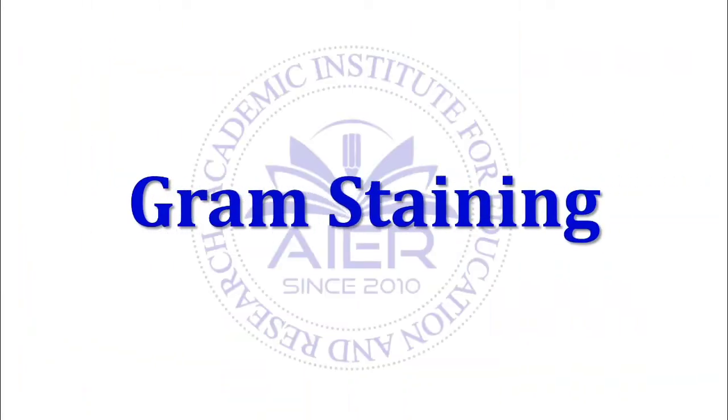So in that particular class, we are going to talk about gram staining, acid fast staining, and different aspects of microbiology. Gram staining is a process by which we can easily identify whether the selected bacteria is gram negative or gram positive. The basic concept regarding gram positive and gram negative bacteria that I have discussed in the first class of the DSE, I hope you all can remember that concept. So here in this topic, we need to talk about the basic procedure of the gram staining, right?